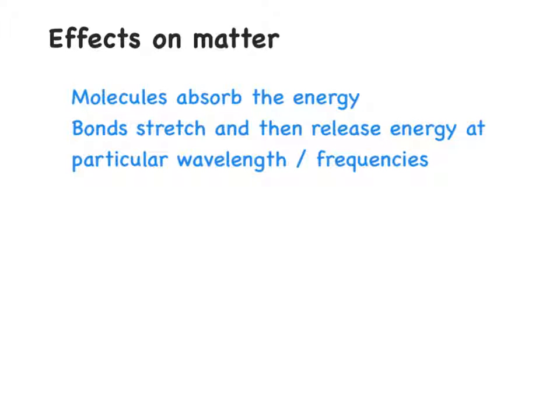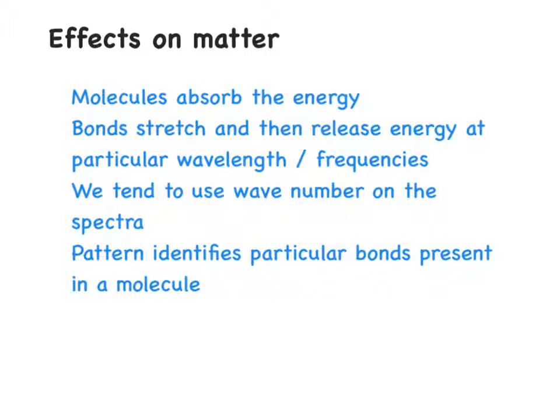And the IR spectrophotometer actually checks on this. Now, if we are very sensible, we would use a double beam. A single beam would just produce the pattern. A double beam would allow us to put a sample in there to compare against. So we'd have a comparative sample. If we had an inkling of what the substance was, we could put it in there and then use the double beam IR to confirm. So it's a very good thing.